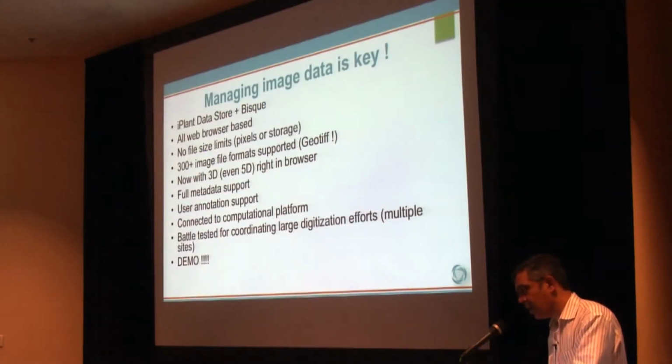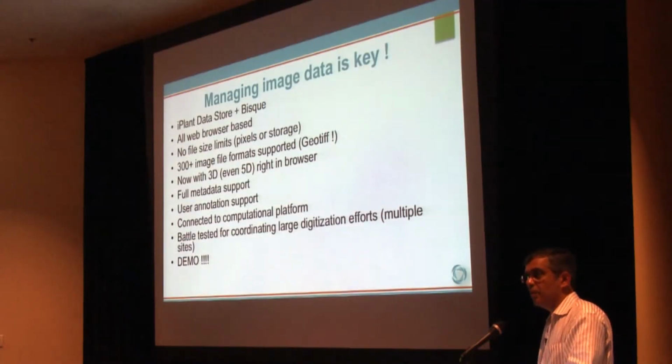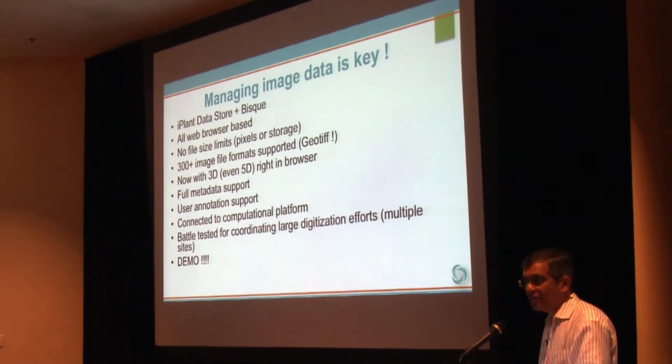The part that I'm really excited about and I want you guys to see today is 3D. How many of you here do 3D reconstruction? And of course, it will be a subset of those of you who do imaging. So I see 1 or 2 hands. It's literally black magic, if you may. Most people have a hard time putting together their 3D stacks, and once you put that together, only one person knows how to do it, and only one person knows how to show it.